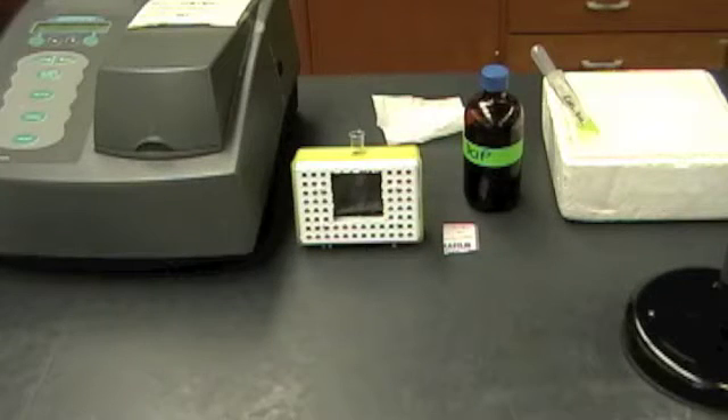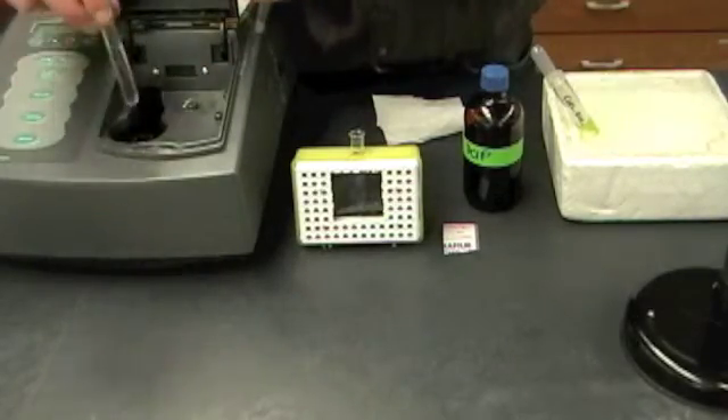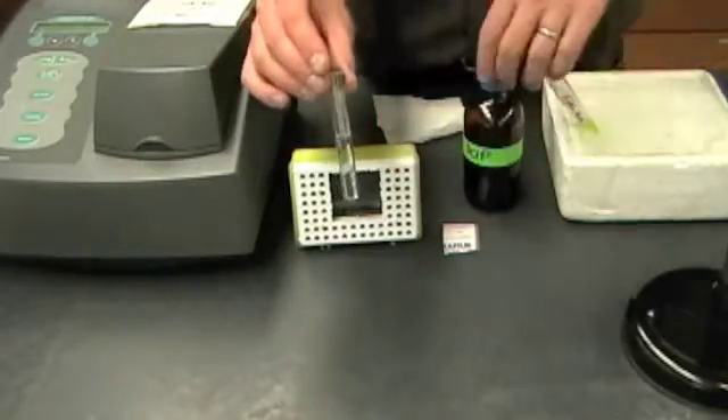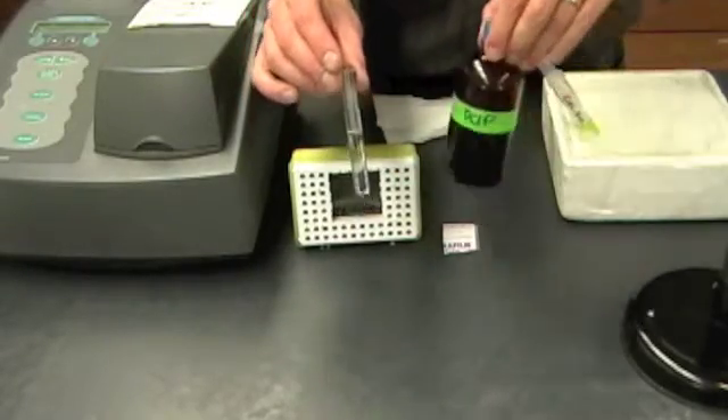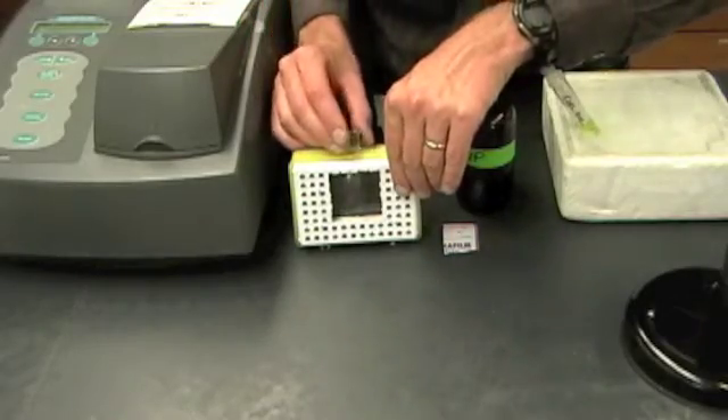Now we're ready to do the first activity, and this is one you have to think through very carefully before you begin. I've already got the spectrophotometer set and I have blanked it. I also have a tube with some of the DCIP solution in it that we're going to use to detect the presence of electrons.